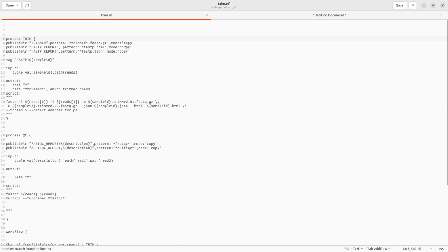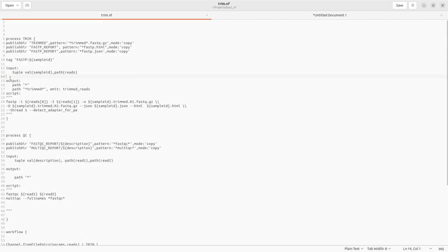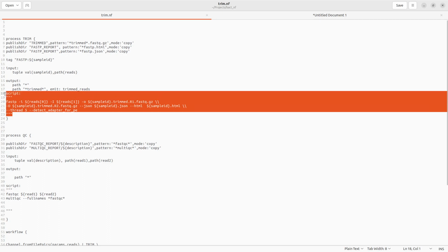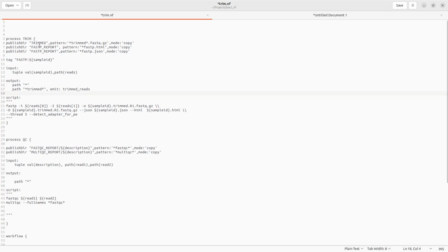So in Nextflow, for a process, the key things you need are inputs and then outputs, and you also need your scripts. Okay, your scripts or command or shell or whichever. I use scripts. So you type process, you give it a name that should be descriptive of what it's going to do. You have your curly bracket to start and curly brackets to close.